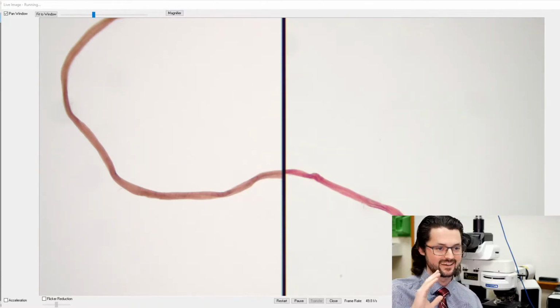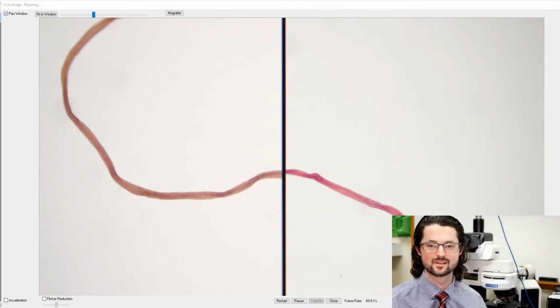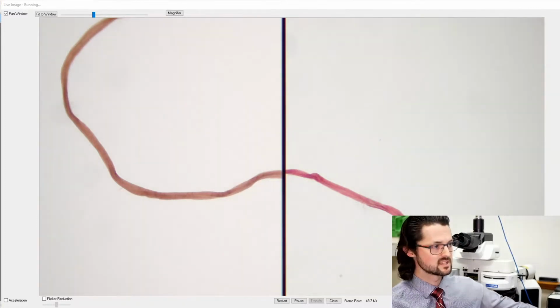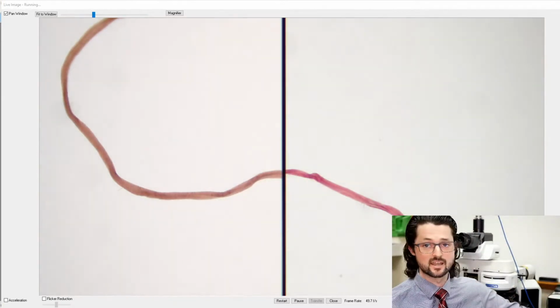I learned very quickly I don't see color like a trace examiner, and I never argue color with a trace examiner. A trace examiner would look at this and tell me a lot, I suspect, about the color differences. But the important thing is that I have an even background, my color is good, and as I change my light intensity, I'm reducing it, but I have the auto exposure on. You can see that regardless of where I place my light intensity, either all the way down or all the way up, with that auto exposure on, you're not seeing a change in the color at all, of the background or of what's on the fiber.